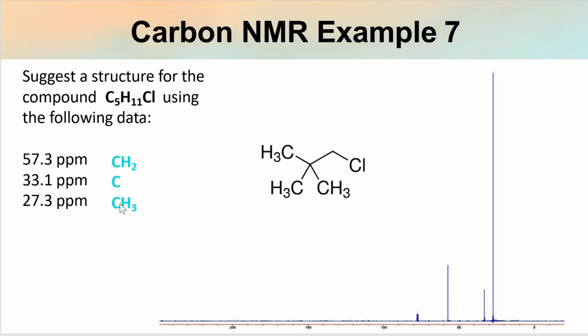So again, sometimes it's a trial and error. So we want to attach some methyls and just add them up to see if it satisfies our molecular formula, right? So that is pretty much how you would work it out.